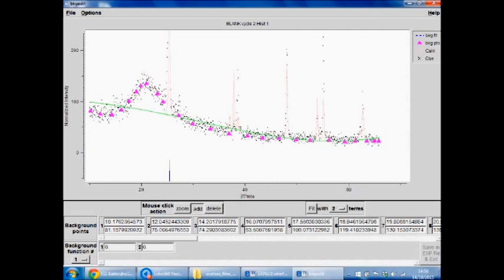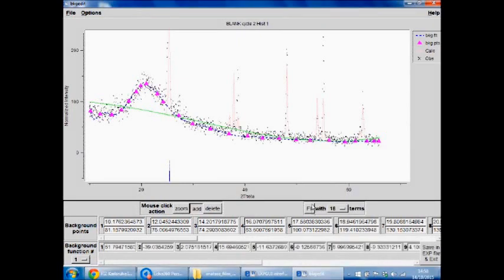So you need to be aware where the artifacts are in that spectrometer, if there's a problem with that spectrometer, and model the background accordingly, or draw the background accordingly. And sometimes at the edges the background goes a bit weird, so you just have to add a few more points, but then not add any more terms, and it does a better job.